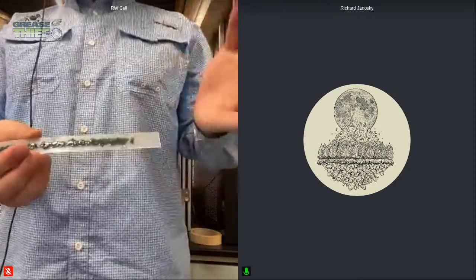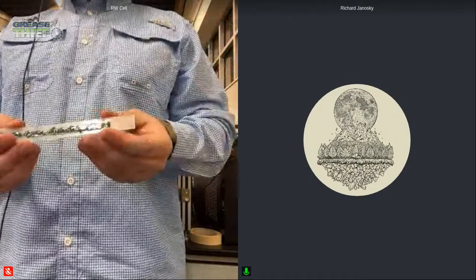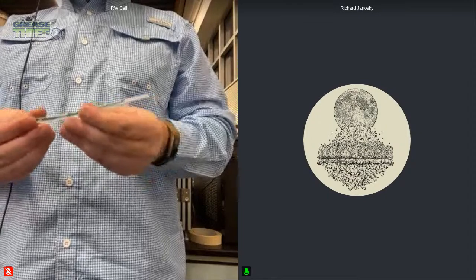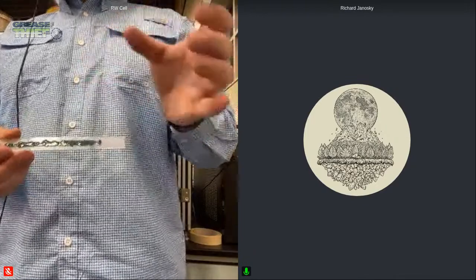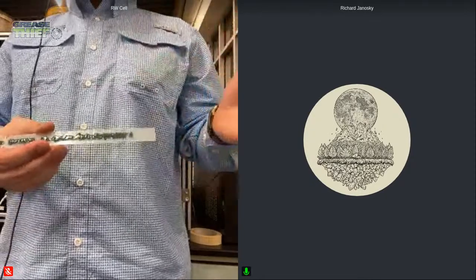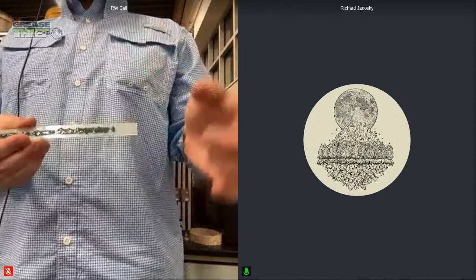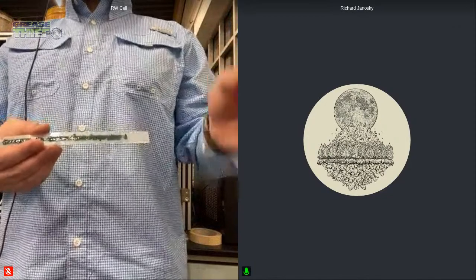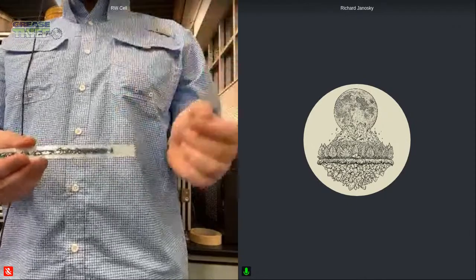Now, obviously, sometimes you get to the end, or if you're doing a test like moisture, we might have to move it into the boat for Karl Fischer or something like that. Then you might have to use the hand. But then the nice thing of this is that the strip, instead of having to transfer the grease by hand, this strip can be put right into it. So when we use the Vapor Pro or when we run a Karl Fischer, instead of having to smear our sample onto the vial, we're able to take this strip and put the strip right in the vial for Karl Fischer. Whether you have a boat or vial, you can put it right in there and then seal it and run Karl Fischer. Or with Karl Fischer, we're able to put that in the vial, put the top on with the septum, and then run that same way.